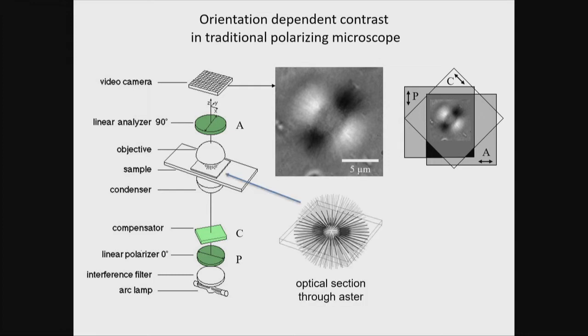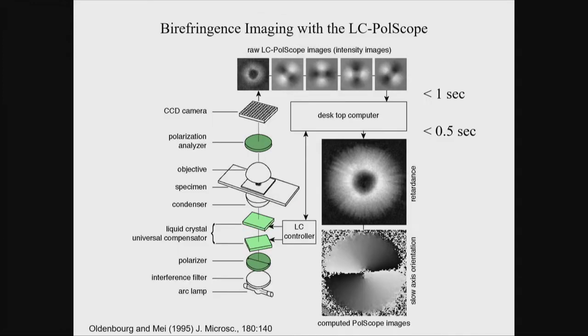And so when I joined at the MBL, we came up with this scheme that we can, instead of having this mechanical, rotatable birefringent plate that's called the compensator, use liquid crystal devices, and we built up a small unit. Let's see, the whole thickness of these three elements: a linear polarizer to start with to get the light polarized, and then two liquid crystal devices that give you control over the polarization of light within milliseconds.